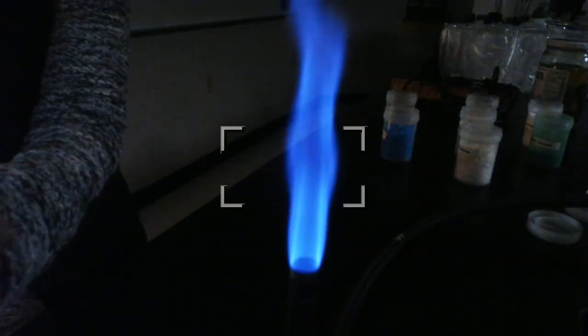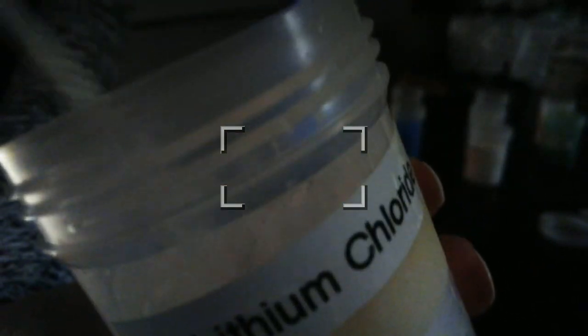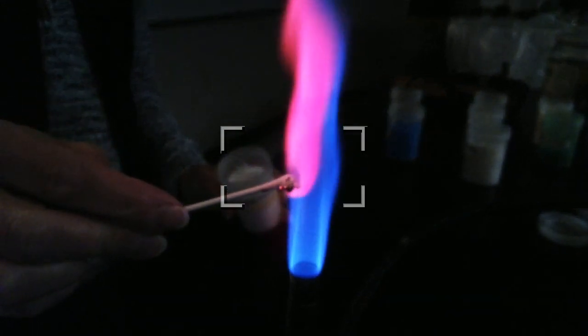So this right here is, whoopsies, lithium chloride. And it's just a white solid. And so I'm going to take this wet Q-tip and dip it in there and try to get some of the solid to stick to the end of the Q-tip. And then we'll burn it.